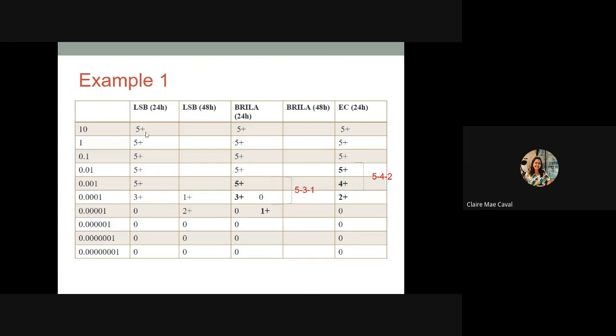So this is the tabulation of results. This is an example, actual raw data. For example, this one, 10. The first, if you picture it, has no dilution happening yet. From the sample, you transfer 10 ml of sample to 5 lauryl sulfate broth tubes, and 1 ml to the first peptone water. So no dilution is happening yet. And after, this is the first dilution.